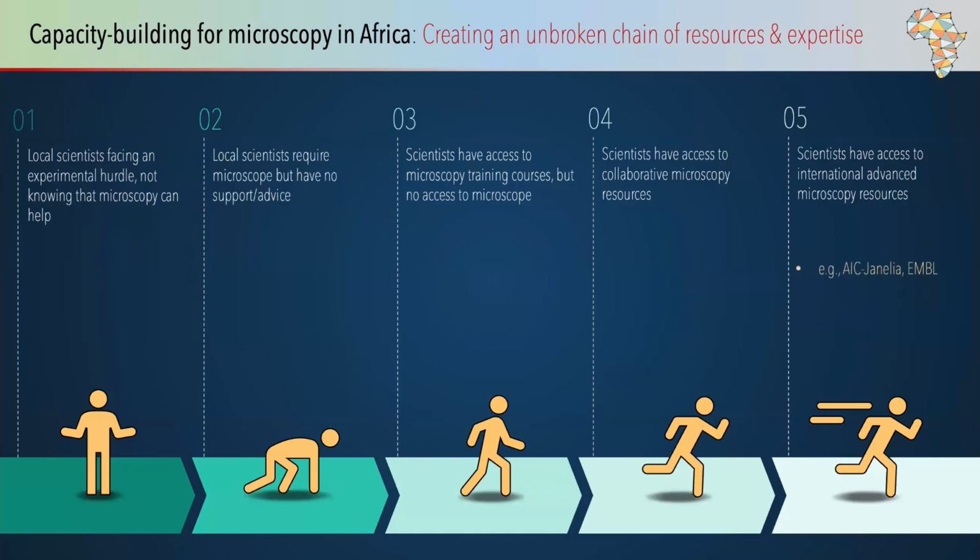Luckily, the most expensive and the most difficult part is already done. There are microscopy resources everywhere, all over the world. So the very first step we have done successfully is to create an open access microscopy center that is dedicated to Africa only, and only for African scientists working in nonprofit organizations.